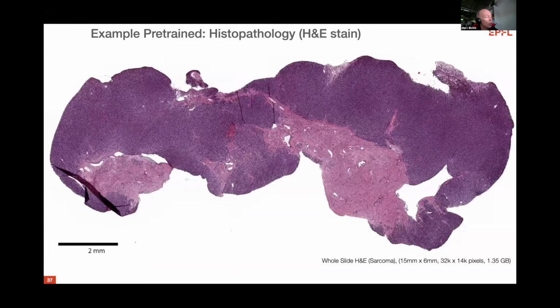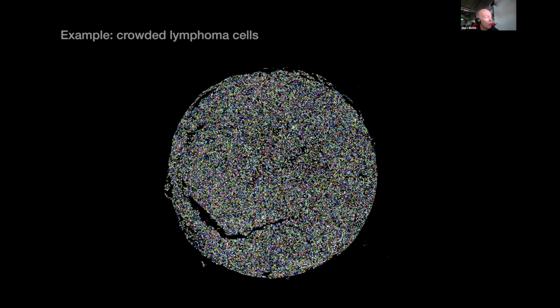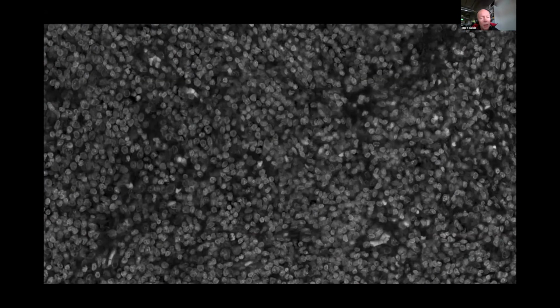I mean, you must do some kind of QC when you're annotating. What would you recommend? Can you have general recommendations, and whether you should make a training set which is largely skewed to the very clear, where you're very sure? Should you try to avoid the things where you're not very sure, so as not to confuse the model?